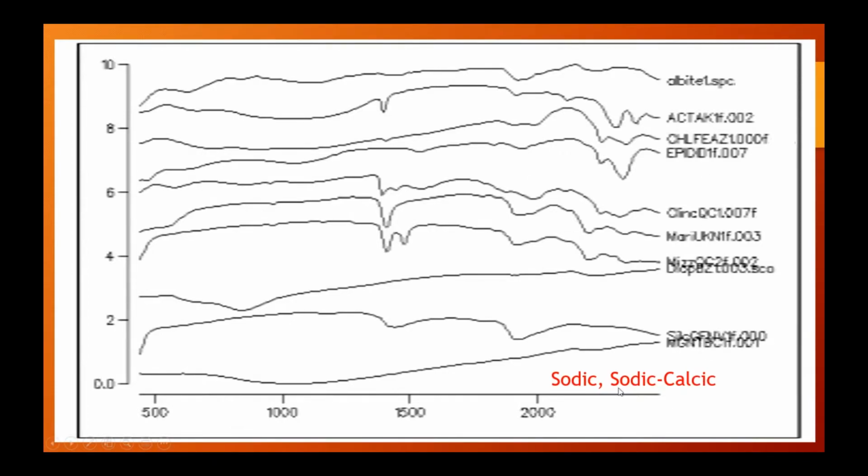This one in particular is a pretty important alteration type to porphyry copper. Just being able to track that temperature change going from sodic to calcic is very important. So being able to see the albite and things like that, this one is very important to be able to track spectrally.